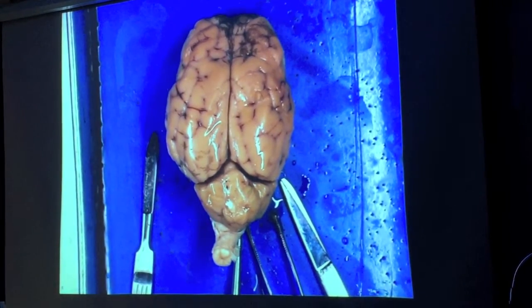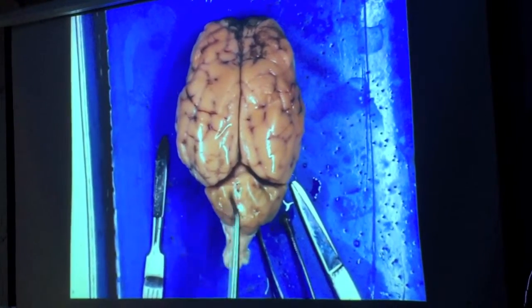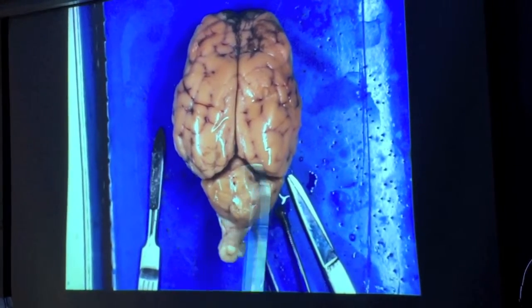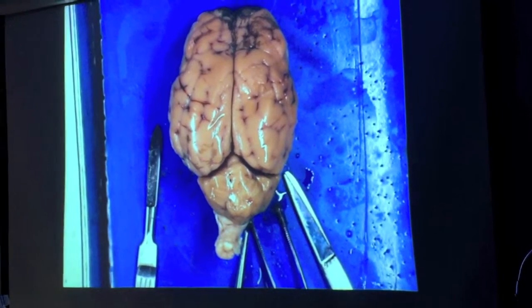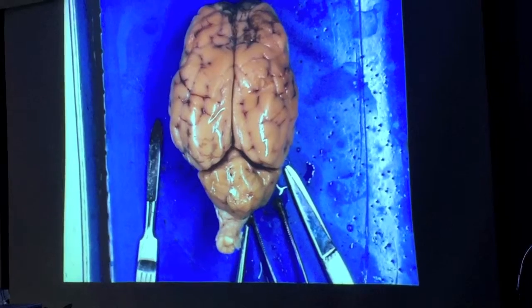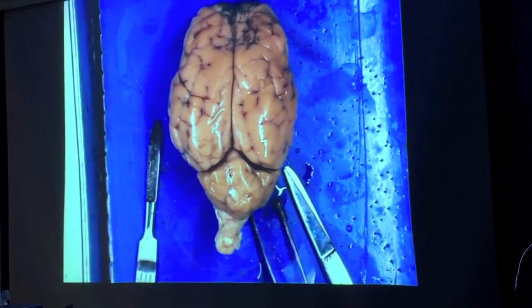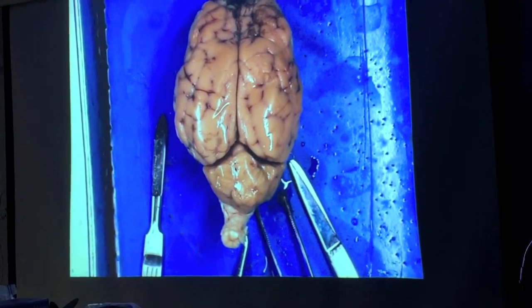The other things, excuse me, that we can identify on the external anatomy are going to be the cerebellum, which is this lump of tissue here. On our own brains, the cerebellum is kind of underneath because a human brain is kind of bent 90 degrees, and so the cerebellum is underneath instead of being straight behind. But we have the same structure in our own bodies. This is involved in fine-tuning muscle movements.